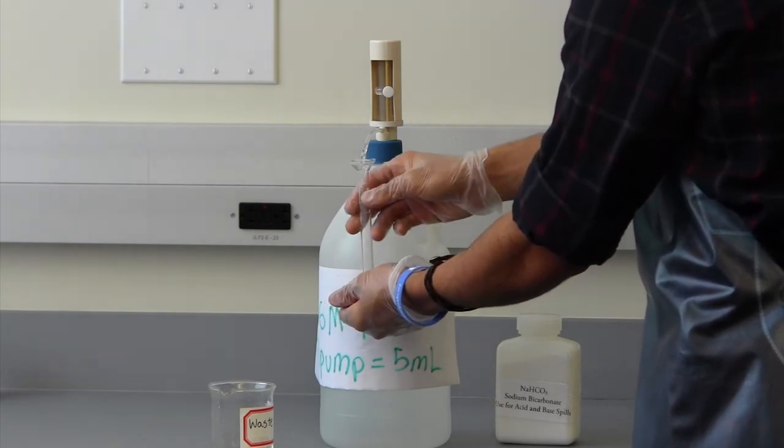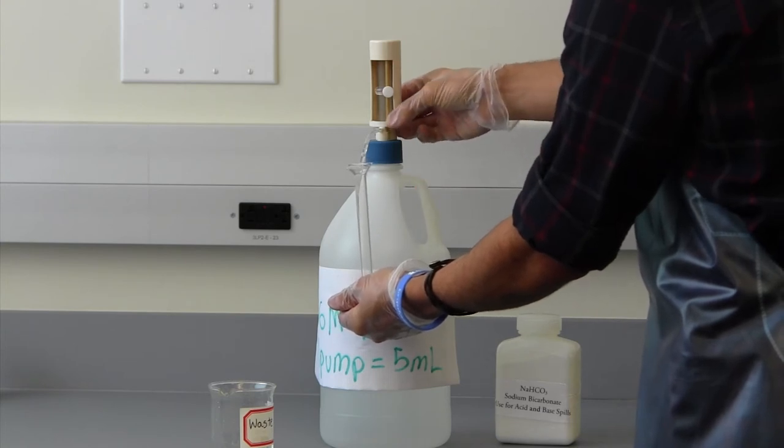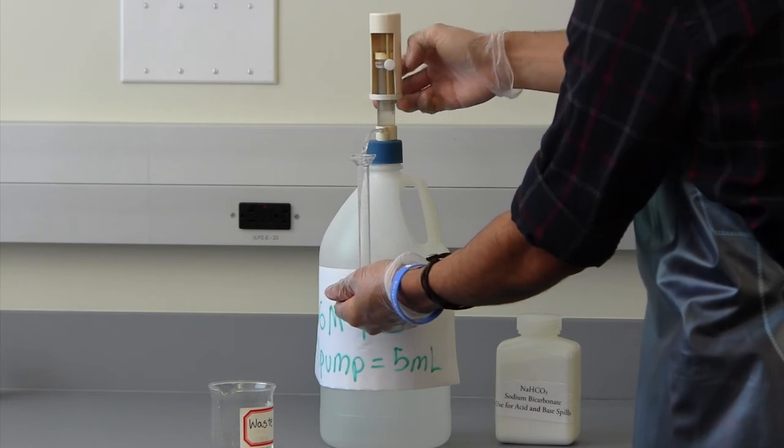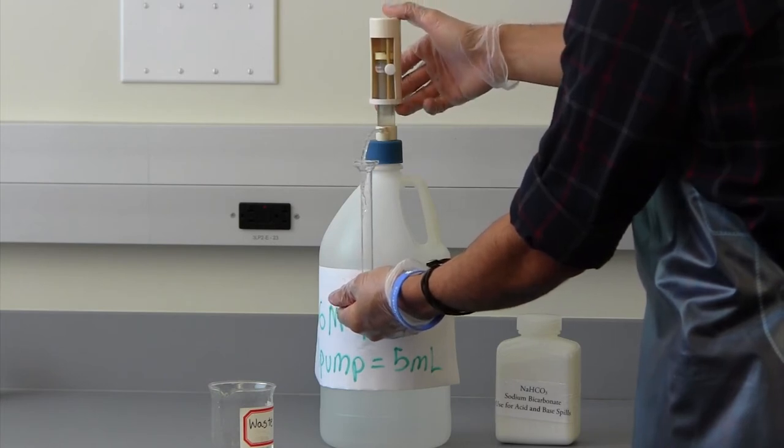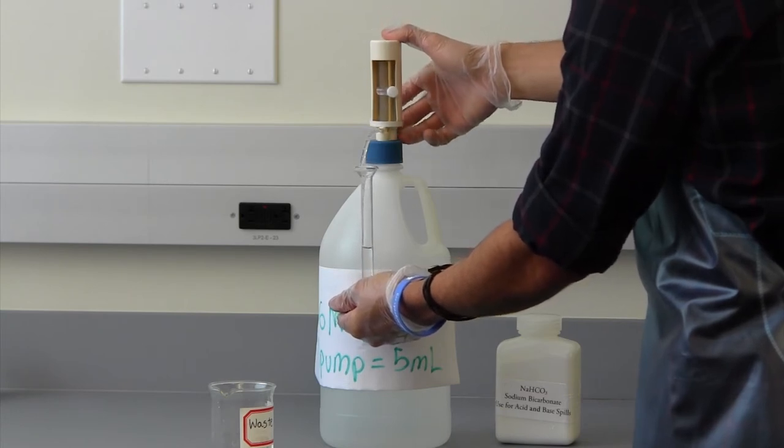To pump, one will carefully lift the plunger to its maximum height. Once the plunger is at max height, one slowly presses the plunger down completely. Now you have correctly pumped reagent into your graduated cylinder.